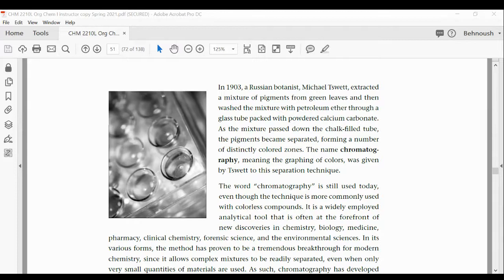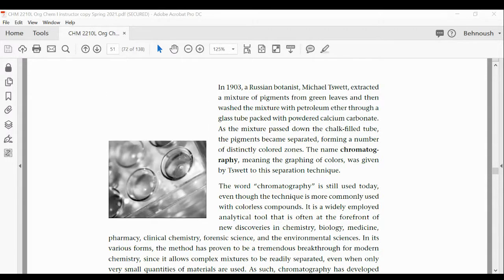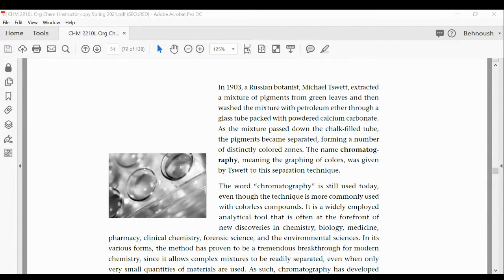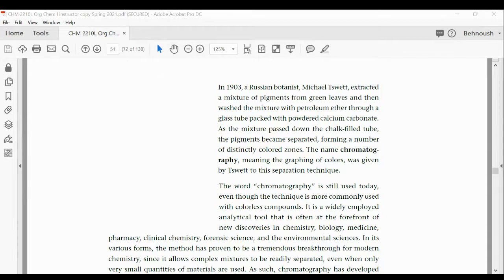Okay. And the applications for chromatography? What are the applications for chromatography? Is separation the only application for chromatography? Separation of very small samples, okay, it's non-invasive. You don't have to have a bulk of the sample. You could have one drop of the sample and you could still do the chromatography.